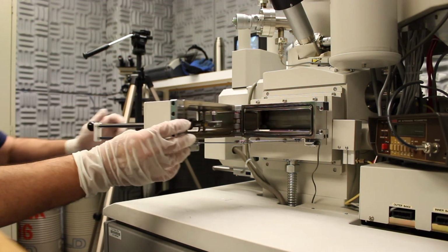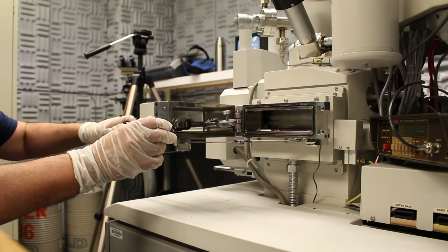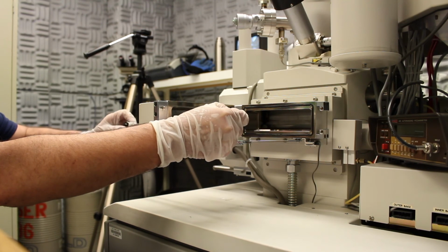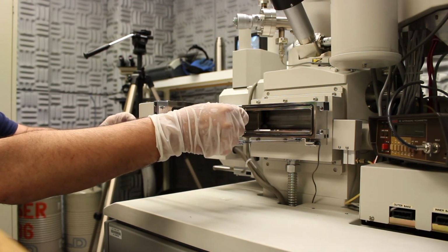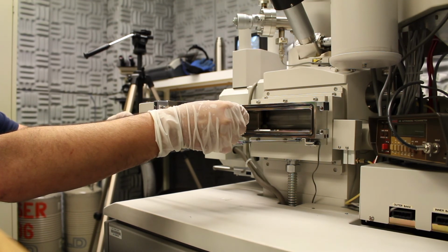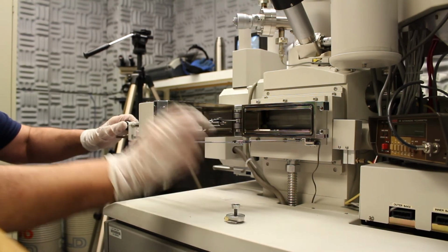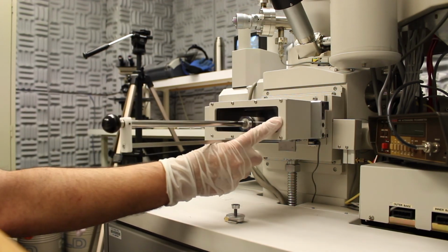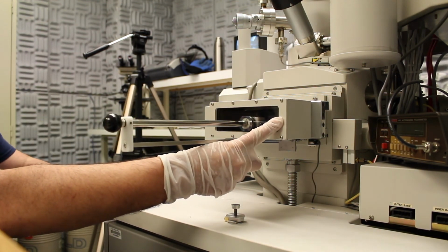Open it up, let it click. Unlock the rod, grab the holder, unscrew it. Put it down. Remember, retract, lock. With the hand, close the housing and pump down.